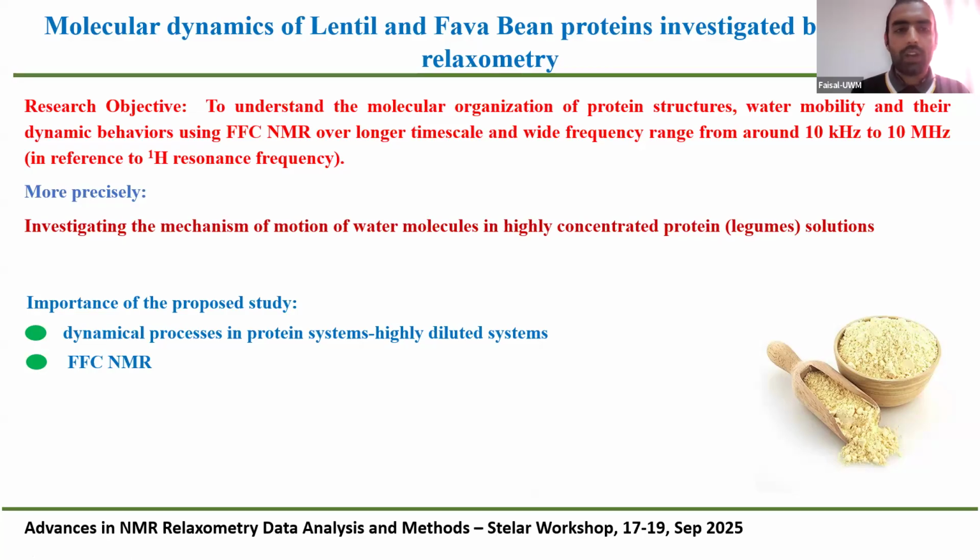And if I talk precisely about this investigation, it is investigating the mechanism of motion of water molecules in highly concentrated proteins present in the legume solutions. We mixed the legume into water to understand the water diffusion, the water properties, and the water interactions. The importance of this proposed study is the dynamical processes in the protein solutions, and the solution is highly diluted, to understand the protein and protein-water interactions. The technique that we use is fast field cycling NMR.